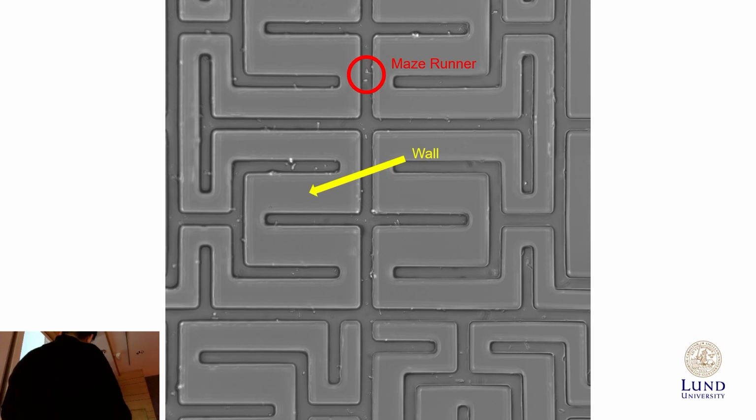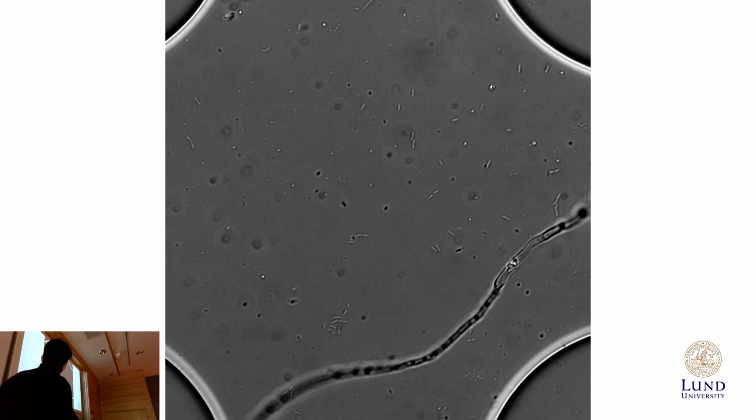And those are the walls, and we construct the maze, and you can see they hide away from each other. Sometimes we have fungal hyphae in there. But then the image quality changes with different soil types and different places. We tried to use a simple thresholding method on the image, but we couldn't get a very satisfying result.